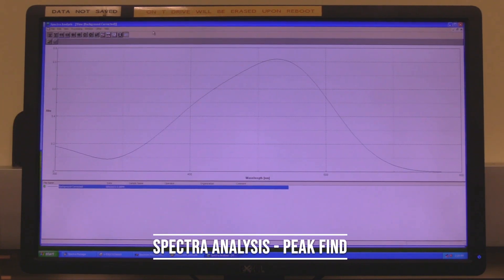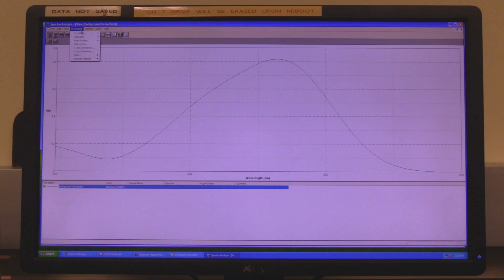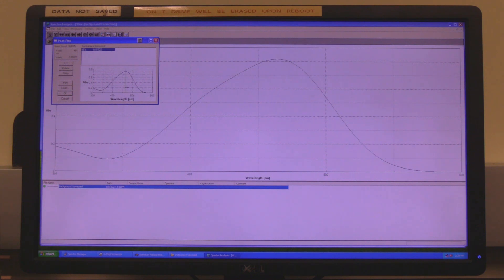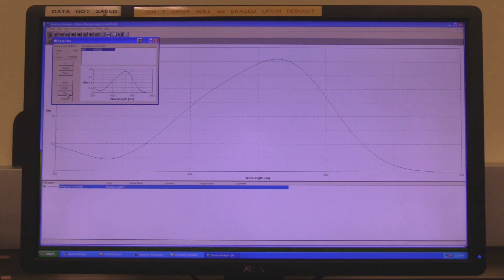Spectra analysis peak find. In spectra analysis, click on processing, then peak processing and then peak find. The peak find window will open. In peak, set how a peak is detected, generally set to top. Set noise level to set the threshold limit for noise. Click on execute. Peaks above the designated noise level will be marked and a list of peaks will be presented above the spectrum. Click on print to save a copy of the data as a PDF. When finished, click on ok.